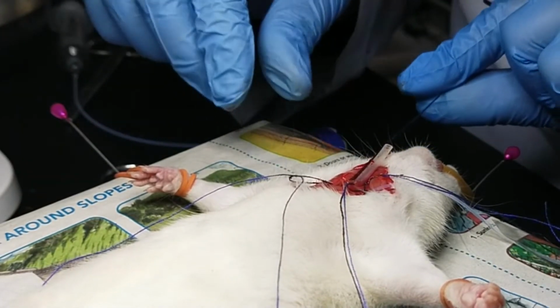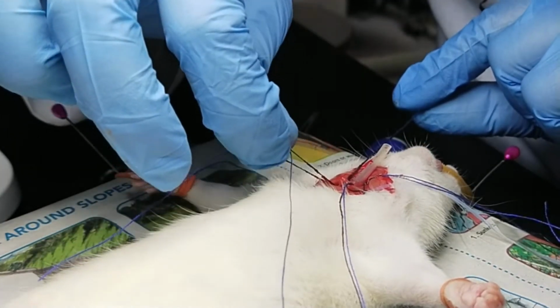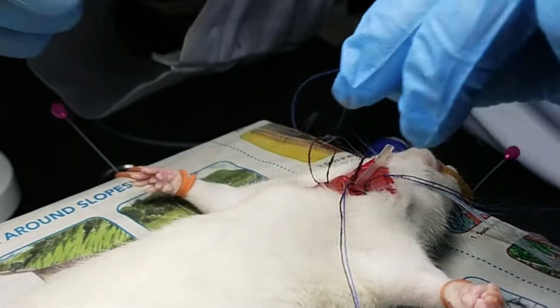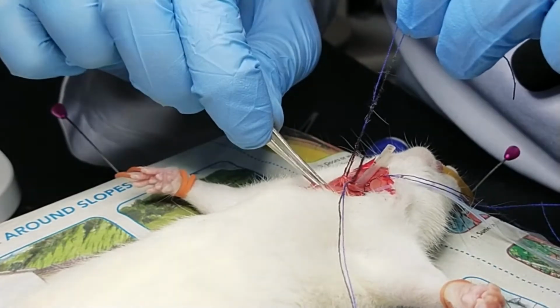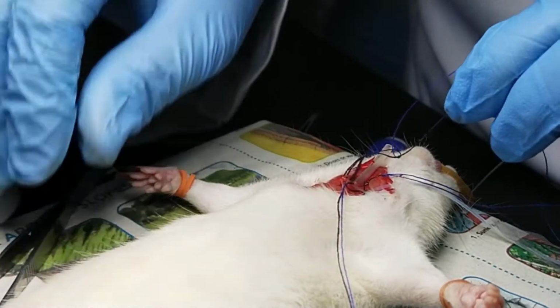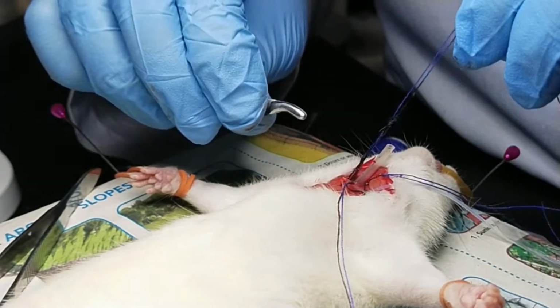Before making any incision, we need to block the other end, because the artery is where the whole system of blood is circulating. If we don't block here before we make an incision, there will be a fountain of blood coming out.